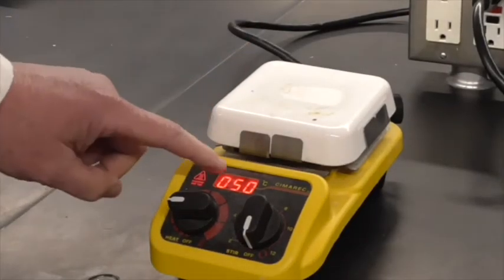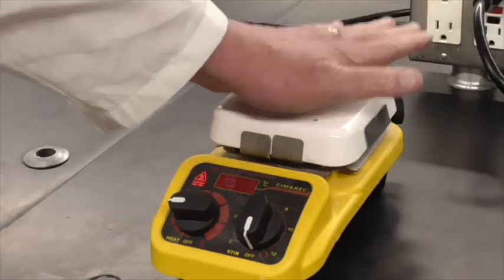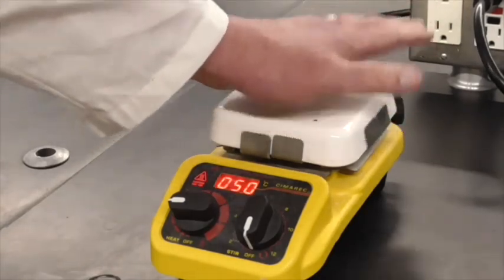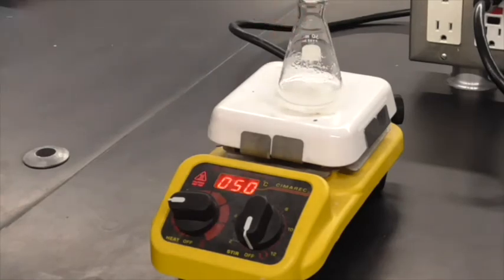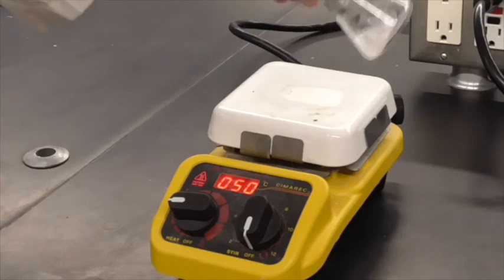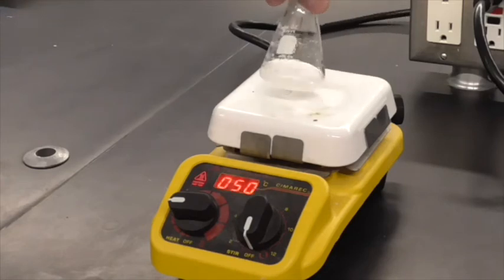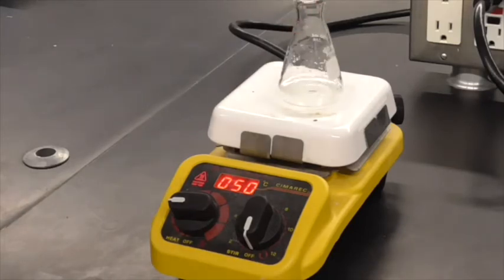Okay, so we're at the hot plate. I've turned it on a little bit earlier just to let it warm up a little bit. It's just warm to the touch, and that's kind of what I want. I'm just going to put this on there just to start getting things to dissolve better. Swirl it around. I don't want to leave it on here too long. It'll start getting the product to kind of burn.